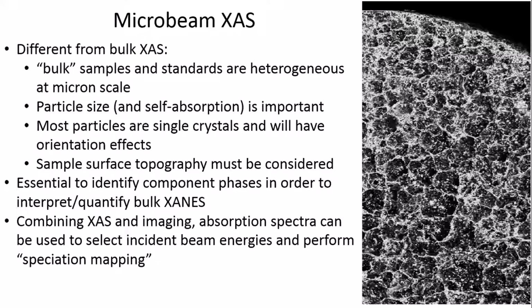Things like that are very important to consider, such as particle size. Self-absorption is always an issue, but even more so at lower energies. And it becomes an issue of what's the self-absorption of what size particle that you happen to be hitting at the time. So you have to consider on a particle by particle basis what's your size and self-absorption effects.